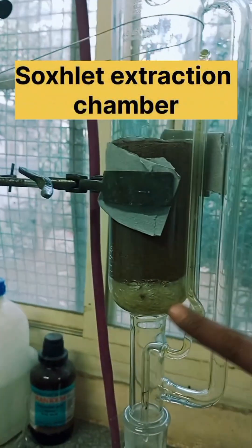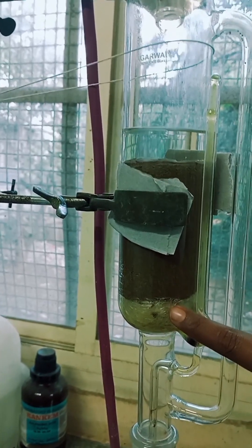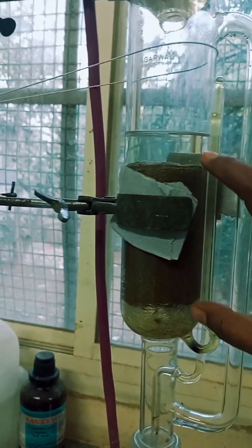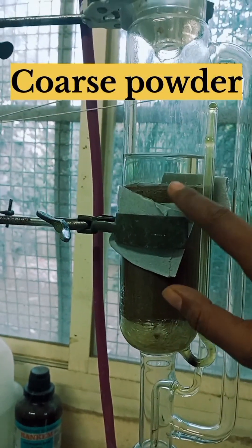The Soxhlet extraction chamber has glass wool filling the gaps. After that, the filter paper is used. After the filter paper, the coarsely powdered form of crude drugs is filled, and again the filter paper is used.